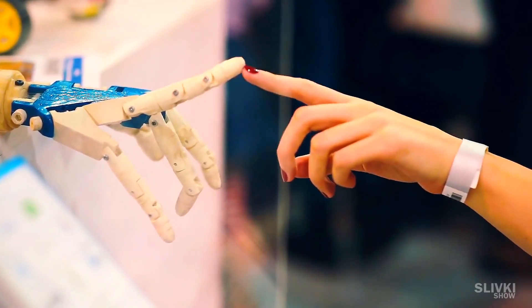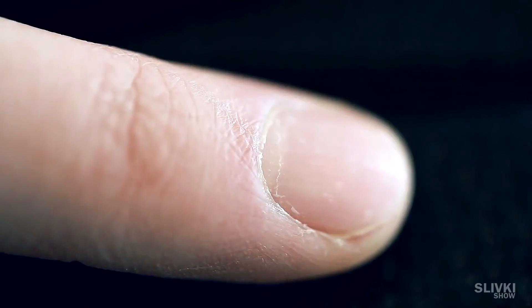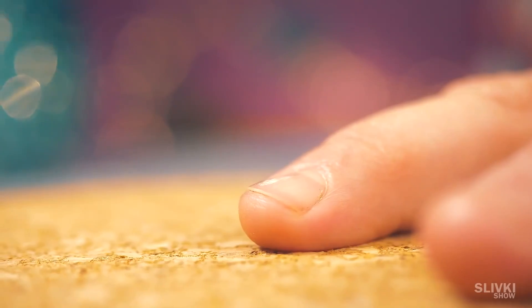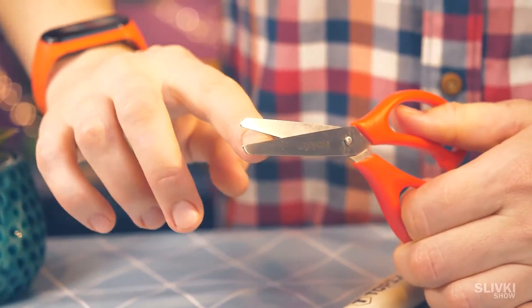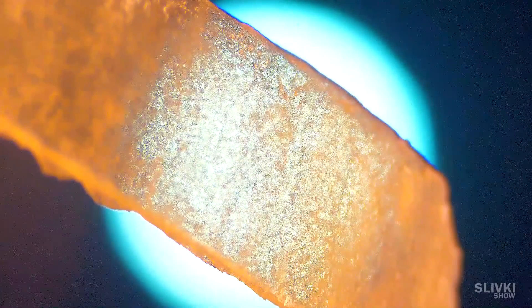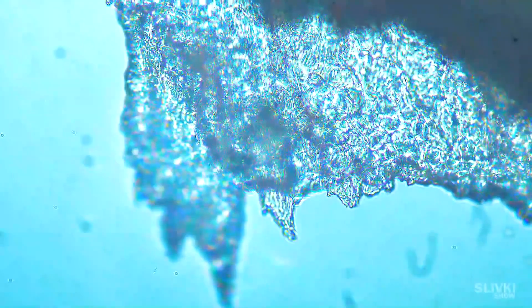Now let's look at a human fingernail. The nail is a dense plate located on the fingertip, and they serve to protect our fingers from mechanical damage — and you can also pick things with them. We cut off a little piece of a nail and put it under a microscope. That's what a fingernail looks like — like a piece of plastic. It seems that in its composition the nail is very similar to skin; it's just that all elements in it are probably packed together more tightly. Apparently that's why they grow so slowly — only 1–2mm per week.